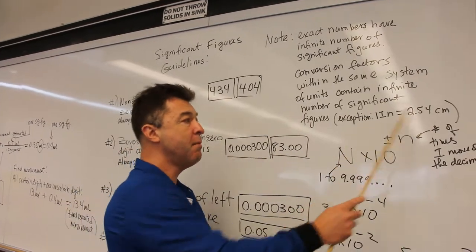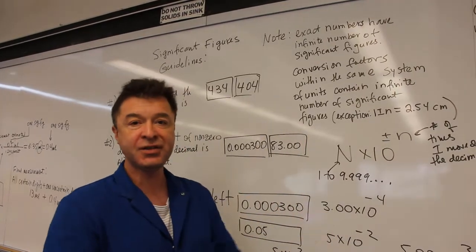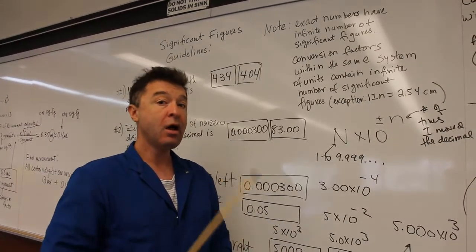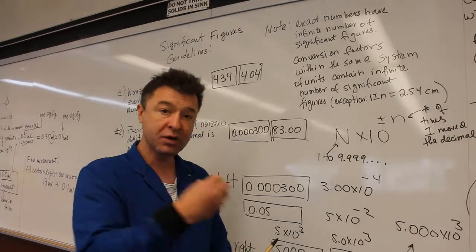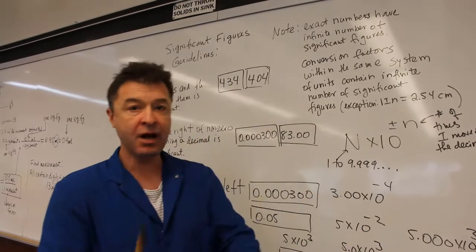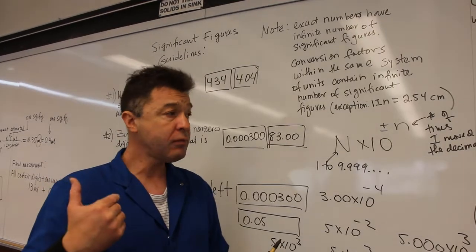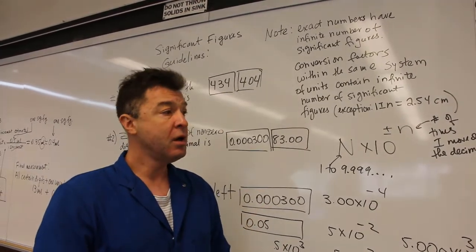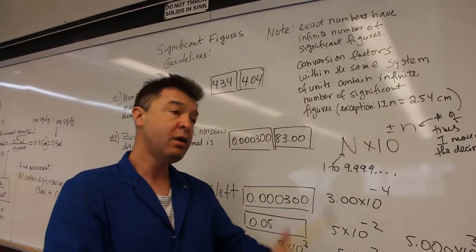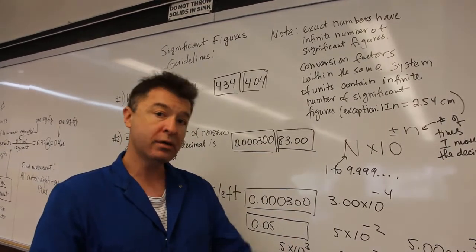Now, any other measurements linking the English system and any other system, you will always have to understand that you don't have exact numbers there anymore, and you will have to consider the number of significant digits in one system versus the other. So I will again go over this as I do the calculations, especially now as I'm going to start making the measurements. And I will show you how this will work when I do the measurement in one unit system, and I'm going to start converting that measurement into the other unit system. So let's go and start making the measurements.